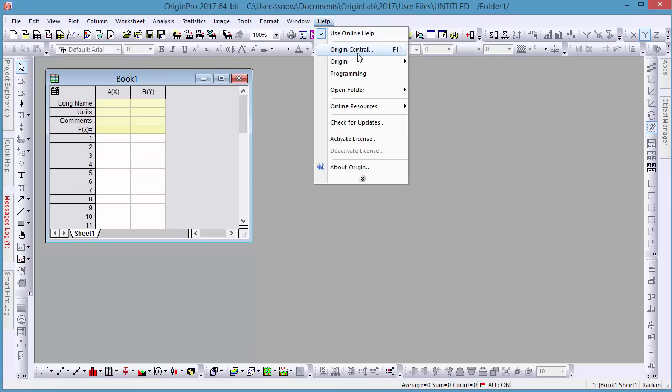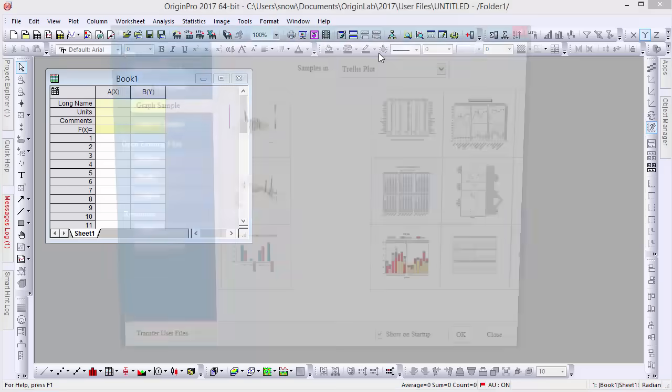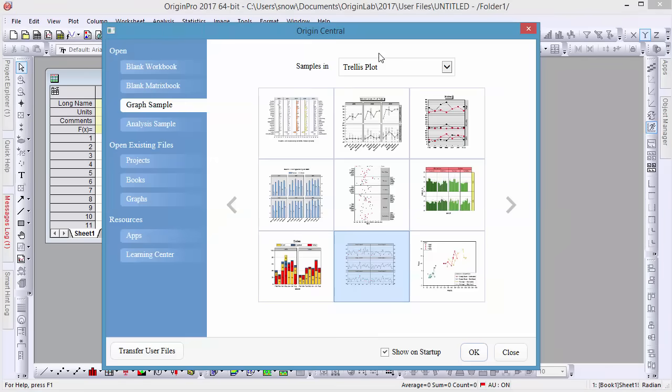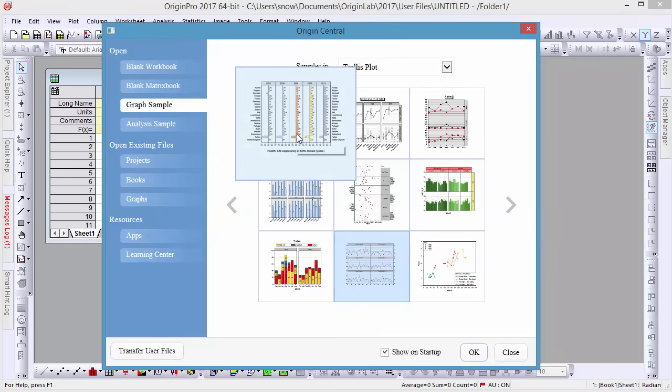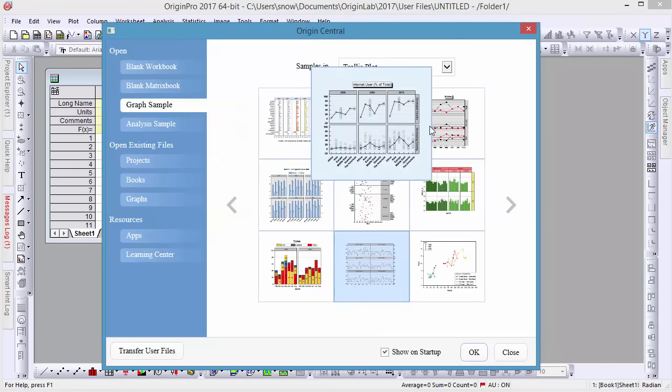Origin 2017 introduces new Trellis plots, allowing users to easily visualize complex multivariable datasets.